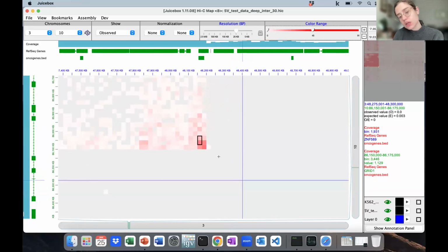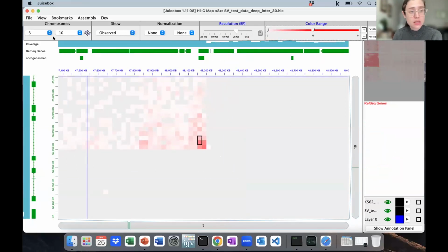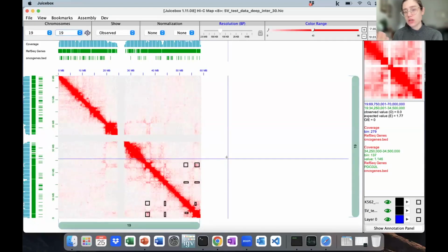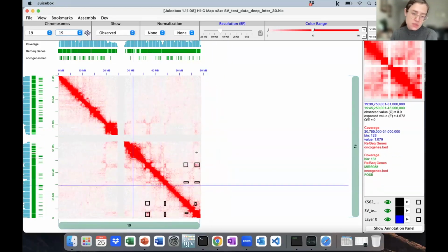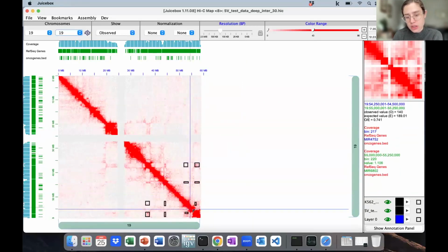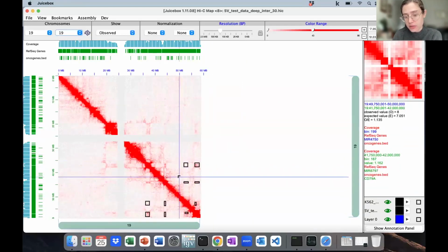So what happens when you have a false positive case? So that can also occur. No software is perfect. We are working internally on writing better algorithms to prevent that, but there can be some cases where you get some false positive calls. And how do you recognize them? So this is an example. This is chromosome 19, and we see that Breakfinder annotated a lot of calls here off the diagonal.